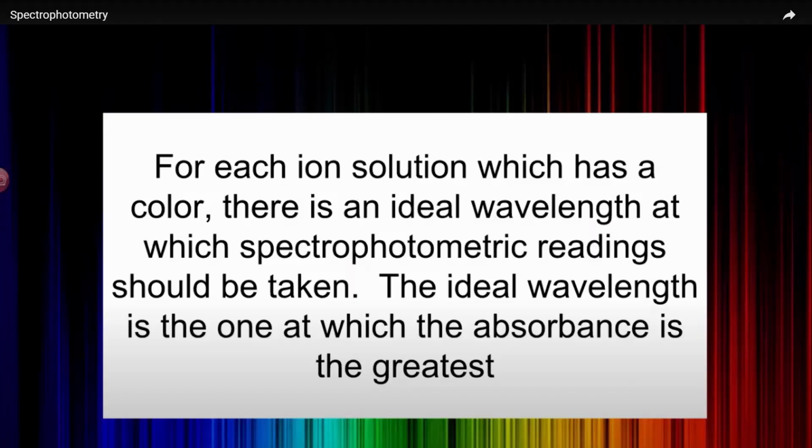So we poured in our 2 reactants. One of them was purple. This is now getting lighter and lighter and lighter. But before it finishes reacting, as soon as possible, I'm going to pop it into our little machine here, right? And I'll have selected my wavelength appropriately, which we'll talk about in a moment. And I'm going to watch the absorbance go down and down and down.